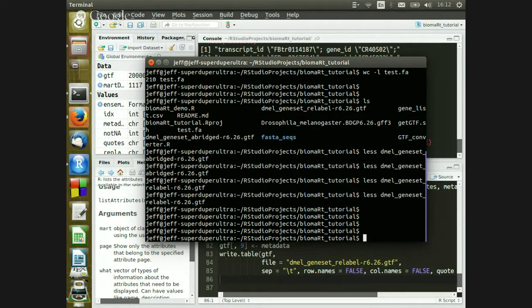And so eventually, you probably won't use this all the time, but when you do use it, you're like, oh, I just saved what would have been 8 hours of work, going to every gene website individually and taking notes. You've also got a record of exactly what the data set was, always in your script.